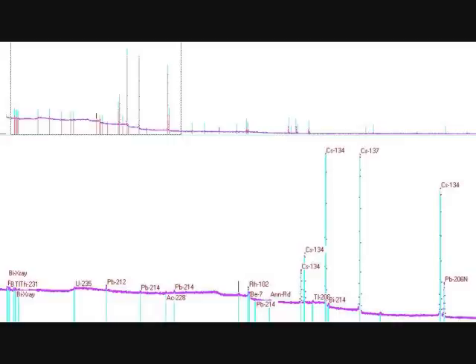As for the X-rays, you can see them on the left there, on the bottom left, and as I said, this is actually due to interaction of ionizing radiation with material in and around the detector, so it's not additional radioisotopes in there, it's just interaction of radiation with matter. The other stuff you can see, for example, uranium-235 is most likely a mistake. It has a very high uncertainty, because you can see it's actually within a line of noise that comes from Compton scattering and stuff like that. So, it is very, very unlikely that there is a detectable peak from uranium-235 in there.